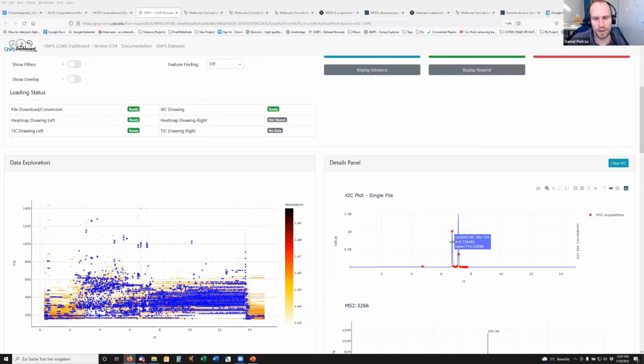But yeah, so this is an important example why combining this chromatographic information with MS information is really powerful. And this is what we do in feature-based molecular networking, where we first extract chromatograms from different molecules and then add MS as qualitative information to them. And in the course of the seminar, we're going to introduce different tools on how to do this systematically and use feature-based molecular networking. Okay, we're close at 12.